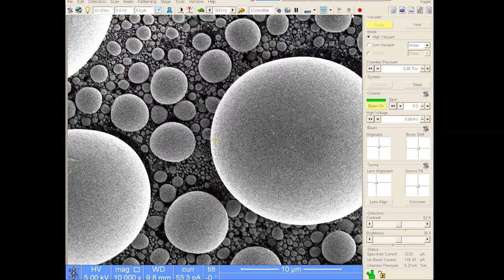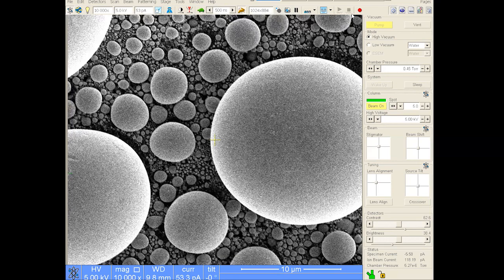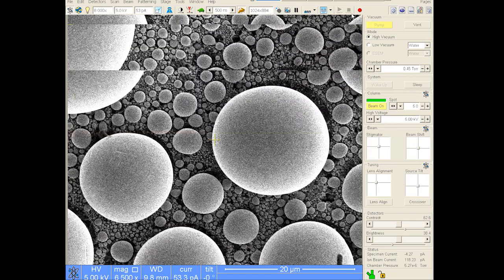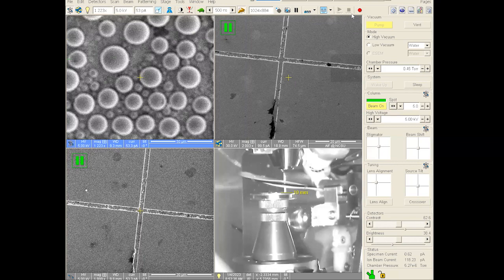Okay, so the next couple of shortcuts I'm going to show you are going to be some that you're not really going to use a lot. But they're handy to know. Okay, let's say I'm off focus, or let's say I'm bringing in the needle. Okay, the lift out needle. Now, the lift out needle, when it's at the eccentric, is going to be at a working distance of 10 millimeters, right? Our eccentric is about 10 millimeters. That's why it's highlighted over on the infrared camera there.